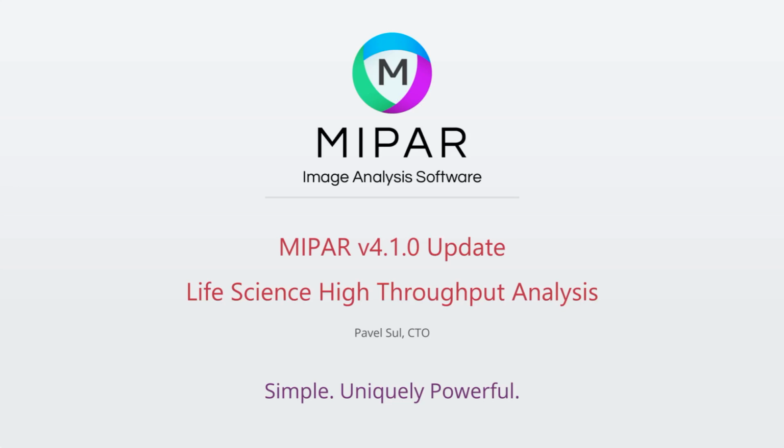4.1.0, the update, which has really been focused on the high throughput analysis in life science and primarily biomedical research, high content screening.